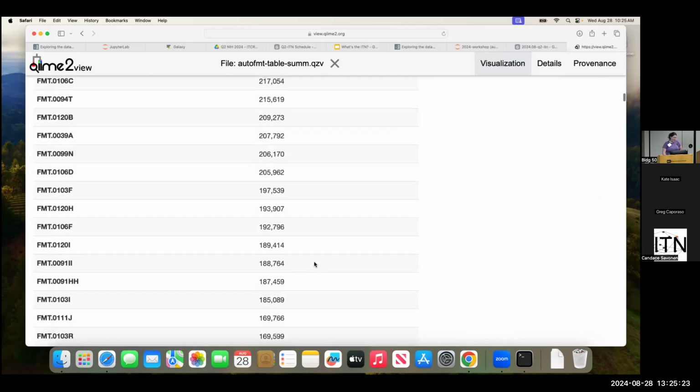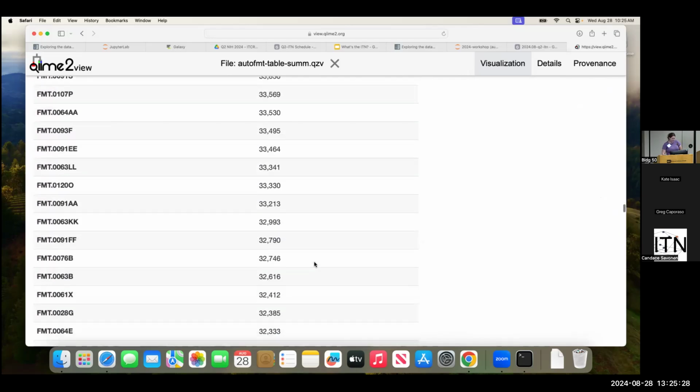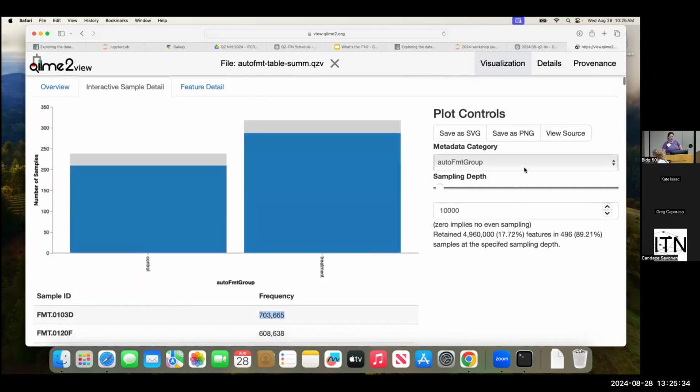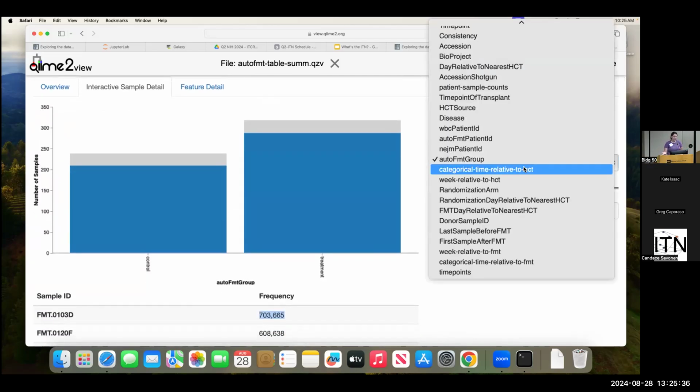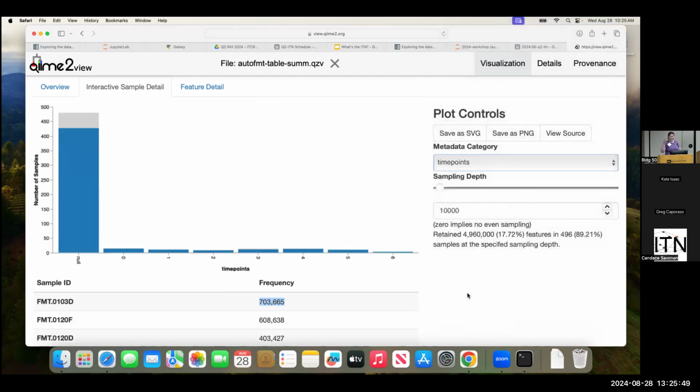And so it's really important to understand the range of your samples and what is important to maintain. Yeah, it's kind of hard. So in this specific study, it depends on what you're favoring. I tend to favor features, meaning I'd like to investigate the sample as much as I can. And so I'm willing to throw out some samples that have lower sequencing depths in order to make that happen.